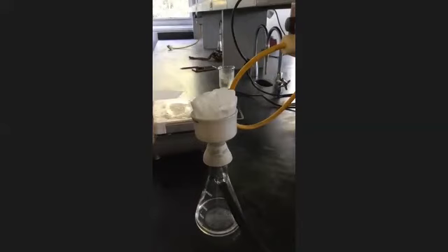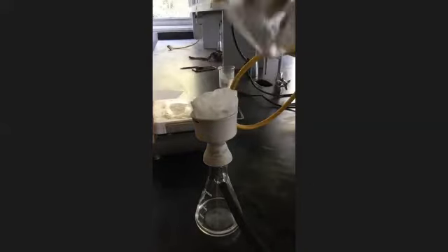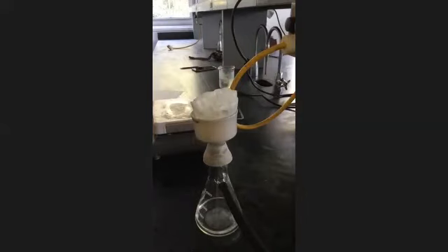It's okay like this. Ideally, you want to get everything. Don't leave nothing. The water is not the problem. One more little piece in there.